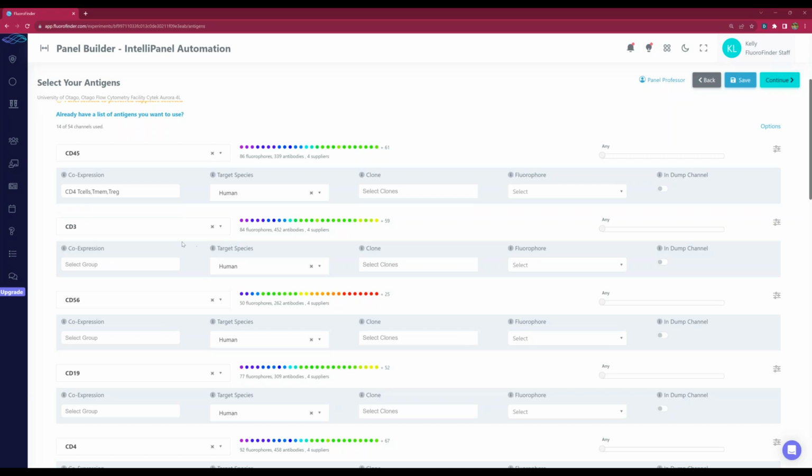So these are really the only ones that I have in here. And then I know that this is going to be abundant. Eventually, antigen density will also be able to be automated, but only for normal, well, healthy human. And even that, we don't want to rely too heavily on, because I don't know a lot of people doing research on only healthy patients.